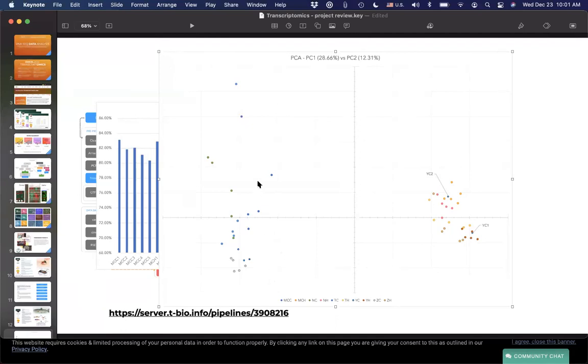Okay, well, the last question here was about where to find data. And so Harpreet, if I could pass it on to you to show two things. So first of all, just in general, how to find data on NCBI. And two, once you find that data, how can you use the SRA table to prepare a pipeline directly from the SRA data set to run the processing pipelines?